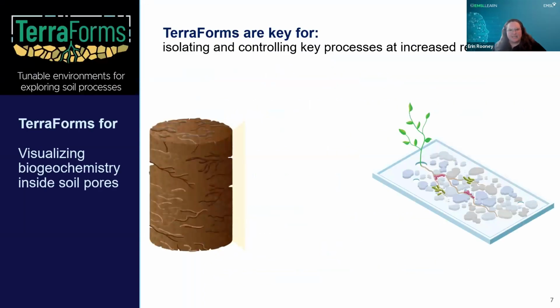Terraforms are a really exciting technology that allow us to visualize biogeochemistry inside soil pores.